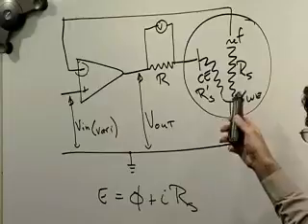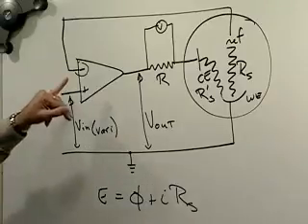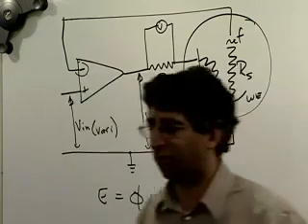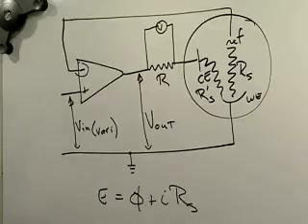Now, modern potentiostats often have a resistance compensating circuit in them. And this is sort of good news and bad news. I don't know if you guys have tried to use this, but there's an interesting thing about these operational amplifiers. What I've drawn here, in the equations that one uses over here, just the simple equations, is for a so-called ideal amplifier. What it doesn't tell you is what a real amplifier does. A real amplifier has a very interesting situation in that as your potential approaches the exact potential that you want it to be, the amplifier goes into uncontrolled oscillations.